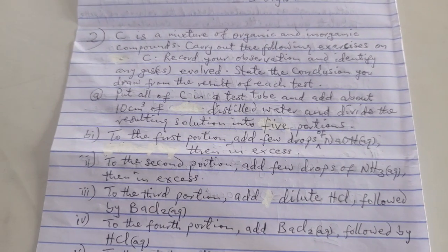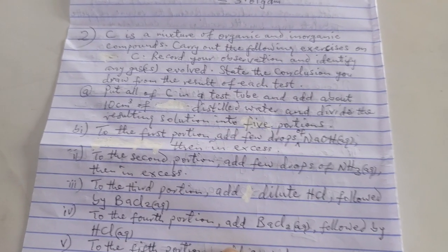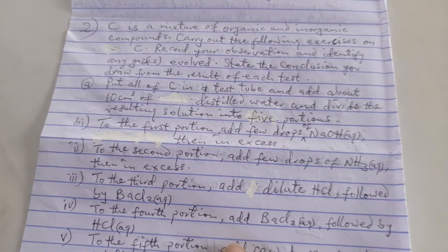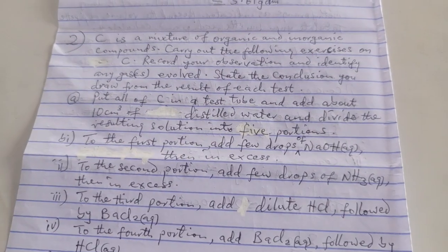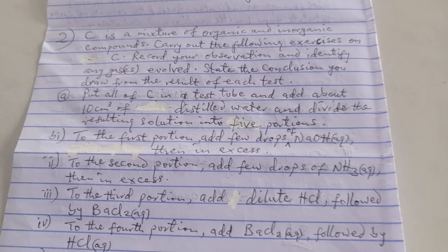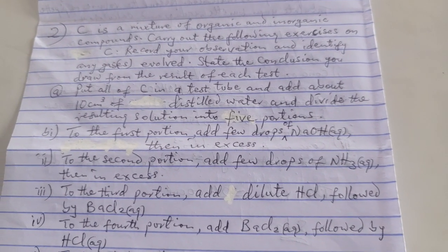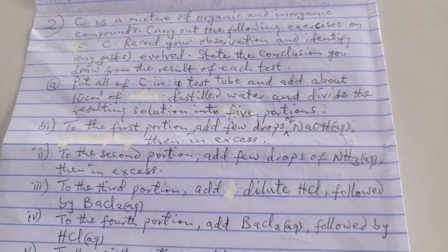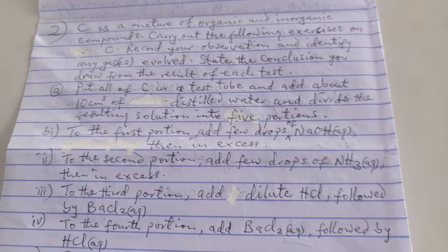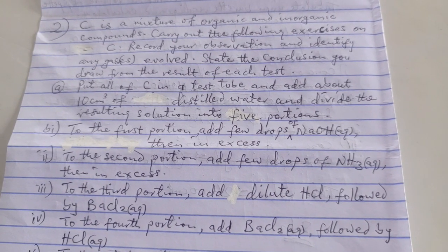So, if you look at what I am presenting before you now, it is question 2, and that question 2 says that C is a mixture of organic and inorganic compounds. Carry out the following exercises on C. Record your observation and identify any gas or gases evolved.